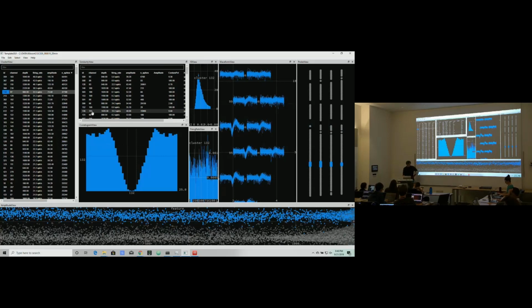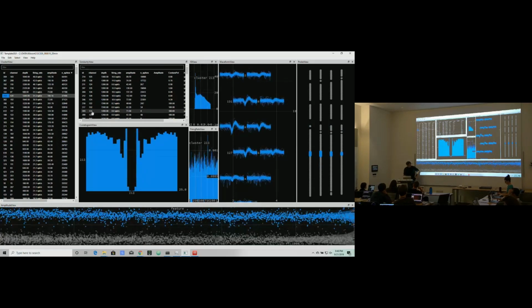Okay, I pressed next again to the next one, another beautiful spike with a great refractory period. So you can see that all of these that have pretty abrupt transitions, these are neurons that really want to fire right away, but they have to wait that long. And if you look at the ISI view, you can see this neuron really likes to have ISIs of, let's see, 0.004 or something. So that would be like 4 milliseconds.